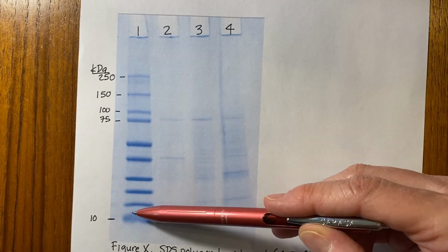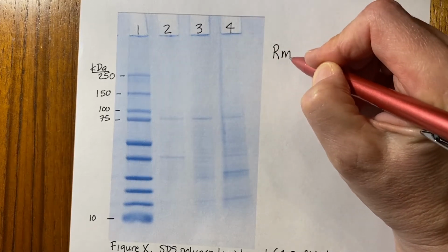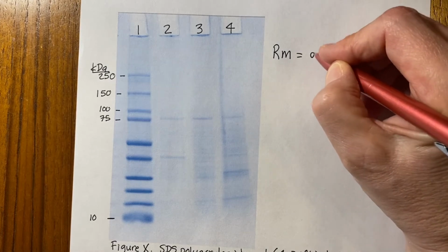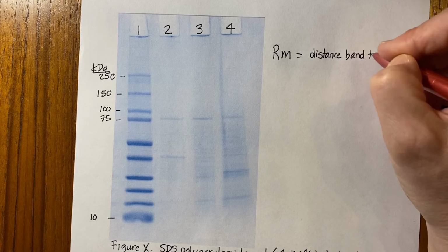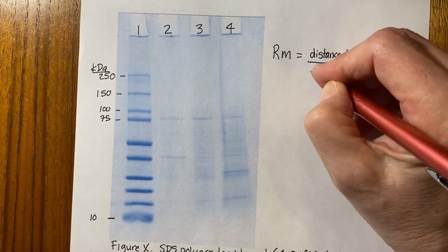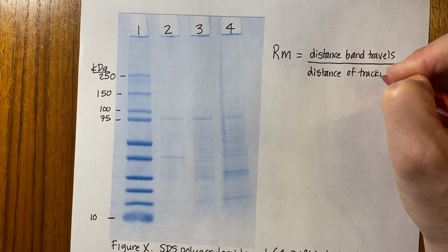The next thing you're going to do is measure how far each of these proteins travels and make a plot. And the way we do that is by calculating something called an Rm. That stands for relative mobility, and that's equal to distance band travels over distance of tracking dye.